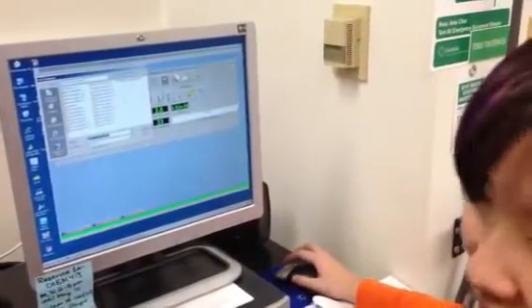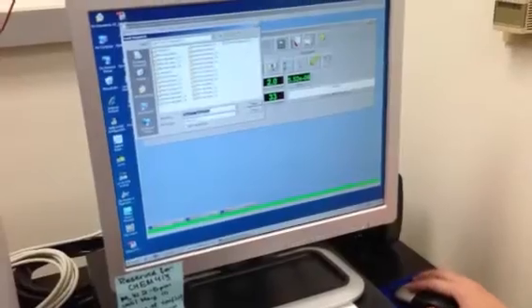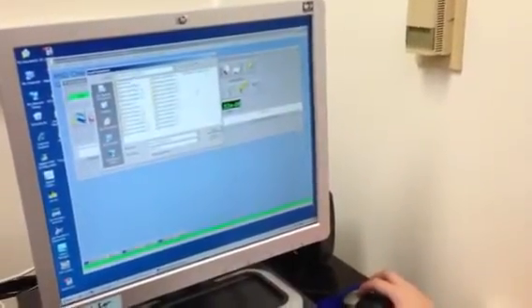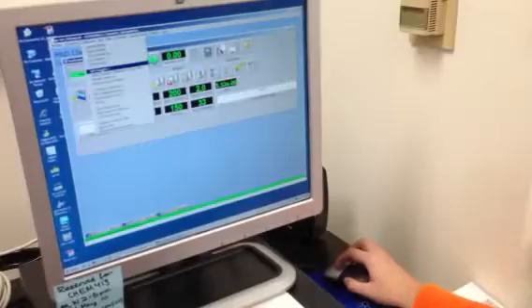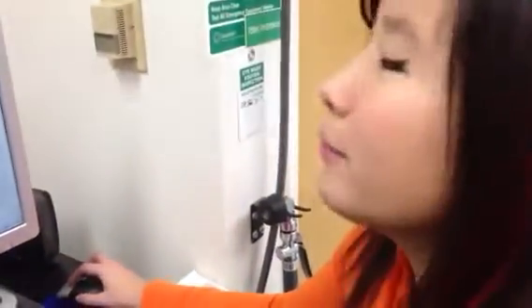The other thing you want to do is load the sequence before you edit, if you were starting from a previously saved sequence — otherwise you can make a new one. If you are going to load a sequence from before, you go to Sequence, Load Sequence, and pick the one under the Chem 413 folder. The sequence will be saved as a .s file. You click that and then it's loaded. Make sure this sequence is what you want it to be, then go to Edit Sequence and verify the tray number, vial numbers, and names are all correct.